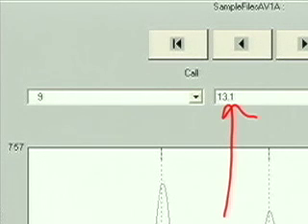The 13.1 allele is the peak that you would have named in GMapper ID, and you would have named it in FSSI cubed. However, True Allele System 2 has accurately named this allele a 13.1. This locus is brought to the attention of the analyst because of the rule firing, but the allele call has already been made.